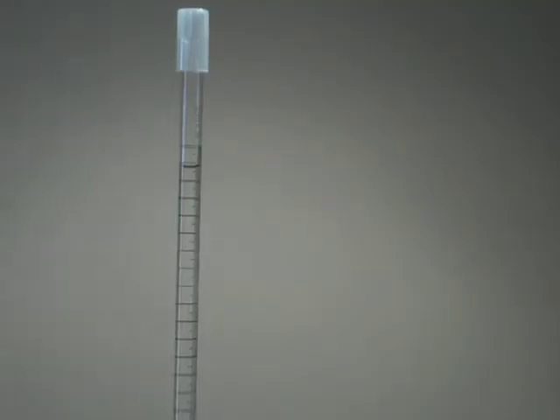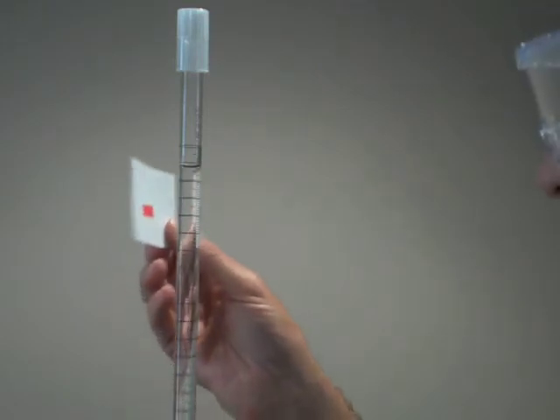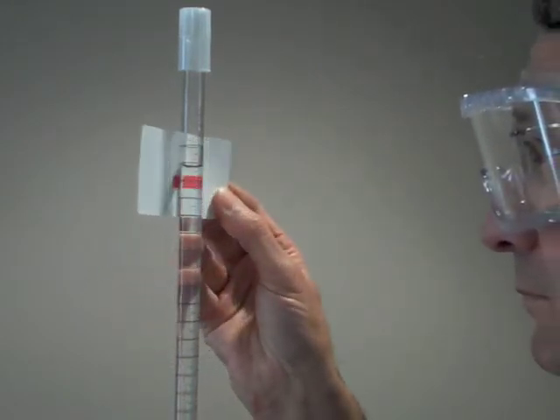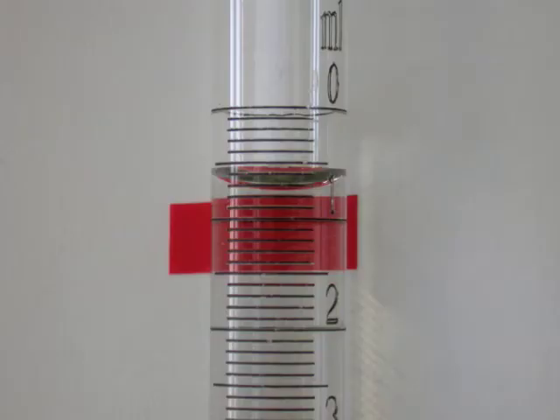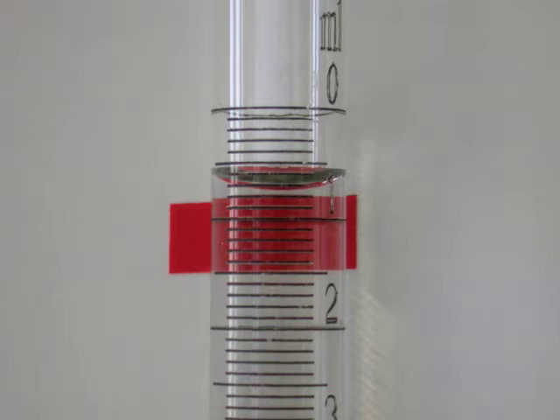Estimate where the bottom of the meniscus is on the graduated scale. You may find it helpful to use a reading card. A reading card is merely a colored rectangle on a white background. By bringing the rectangle up just below the meniscus, colored light is reflected off the curved surface to give a distinct outline against the white background.